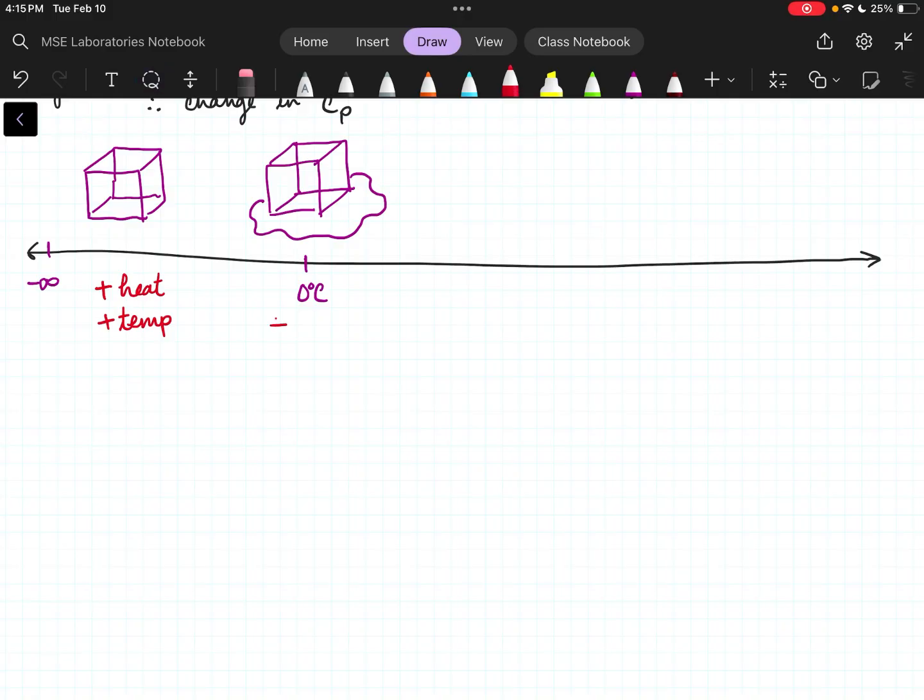What happens here, even if I add heat and the temperature stagnates, that looks like a plus. It's a T, I promise. And I'm realizing I probably should have written temperature with a capital T because that is what the world has decided. Temperature is a capital T. It's just the rules. I don't make the rules, I just follow them.